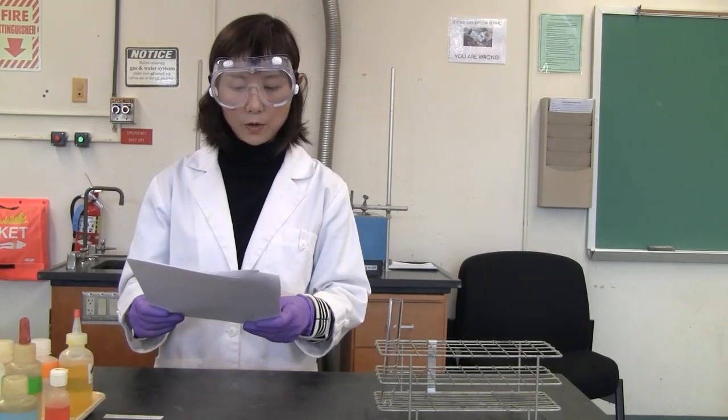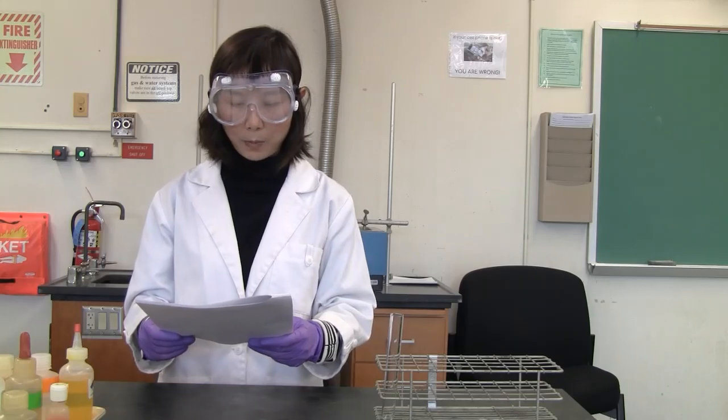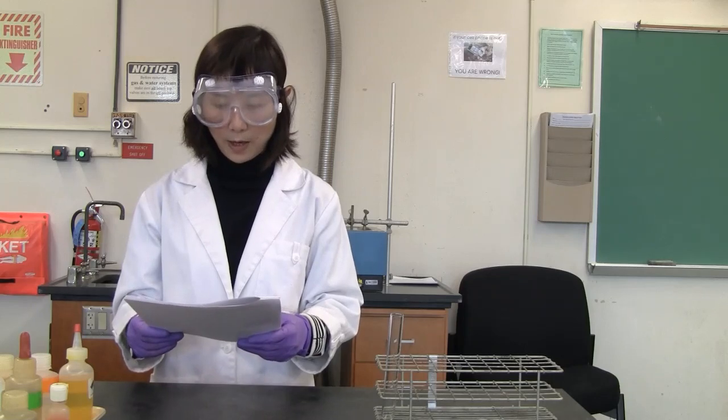Okay, here is Experiment 112, chemical equilibrium and Le Chatelier's principle. I'm going to follow the procedure and you're going to answer a question based on the observation. So, part 1: chromate ion can be converted to dichromate ion by its reaction with acid. This is a reversible reaction as indicated by the double-sided arrow. So the equilibrium is already put down there.